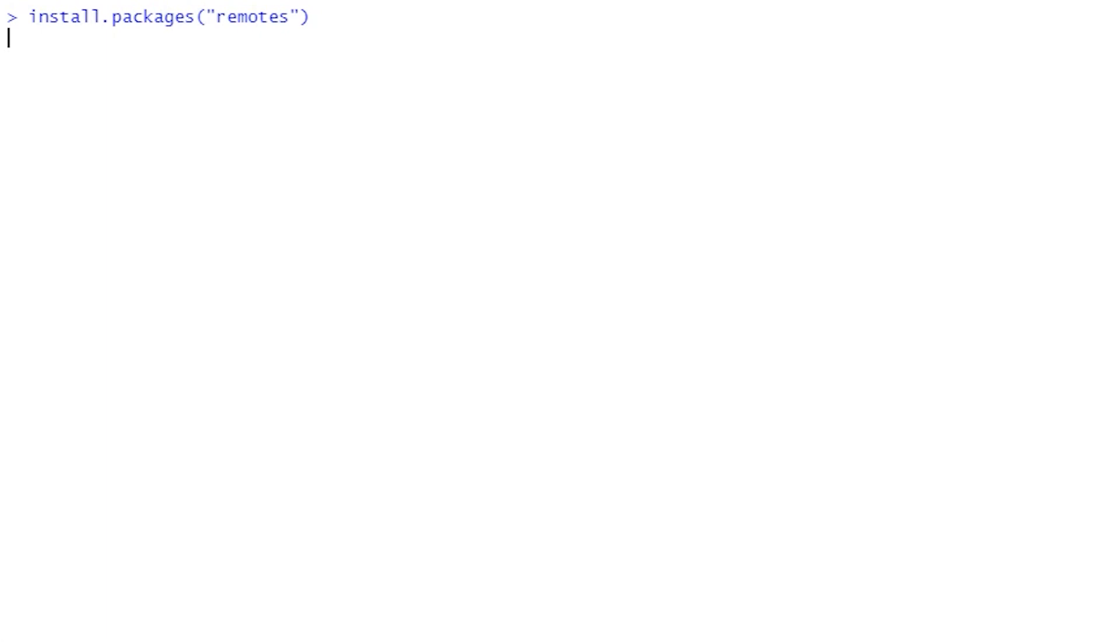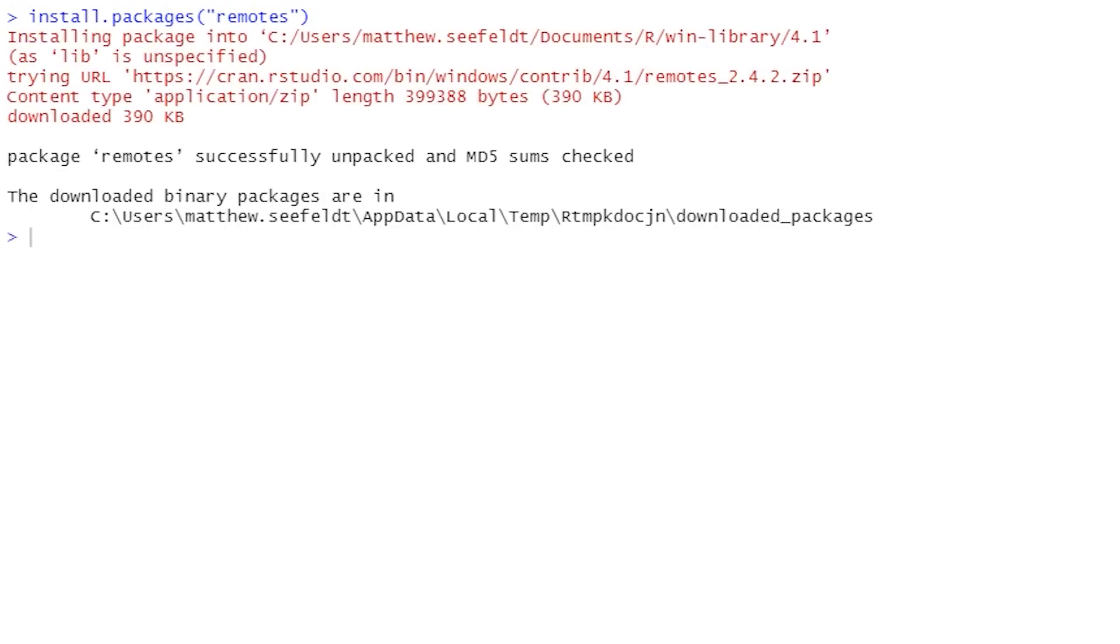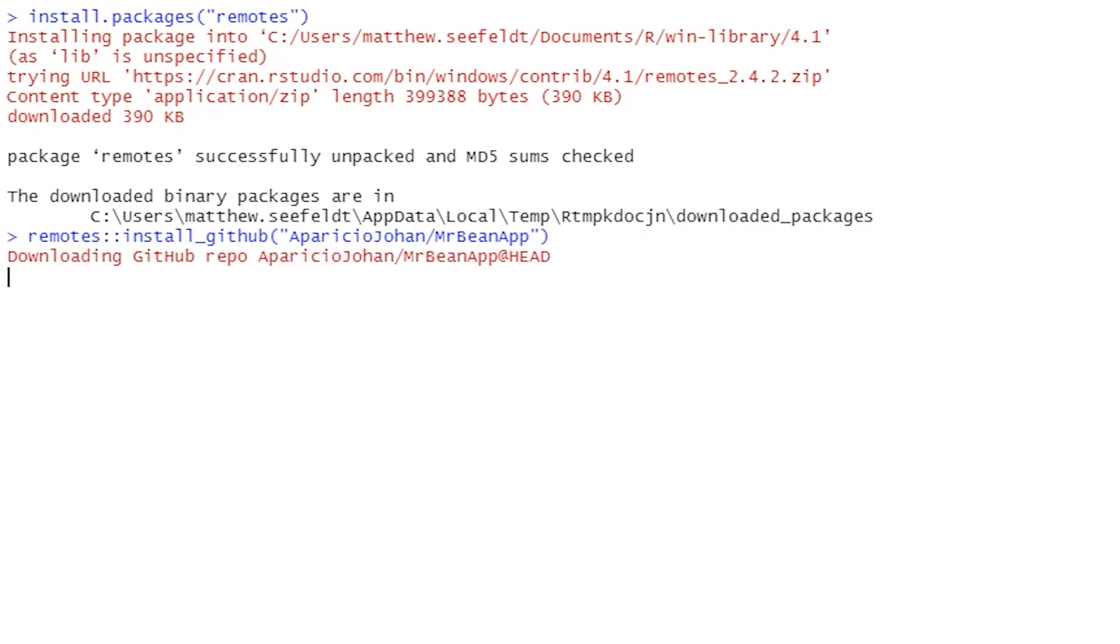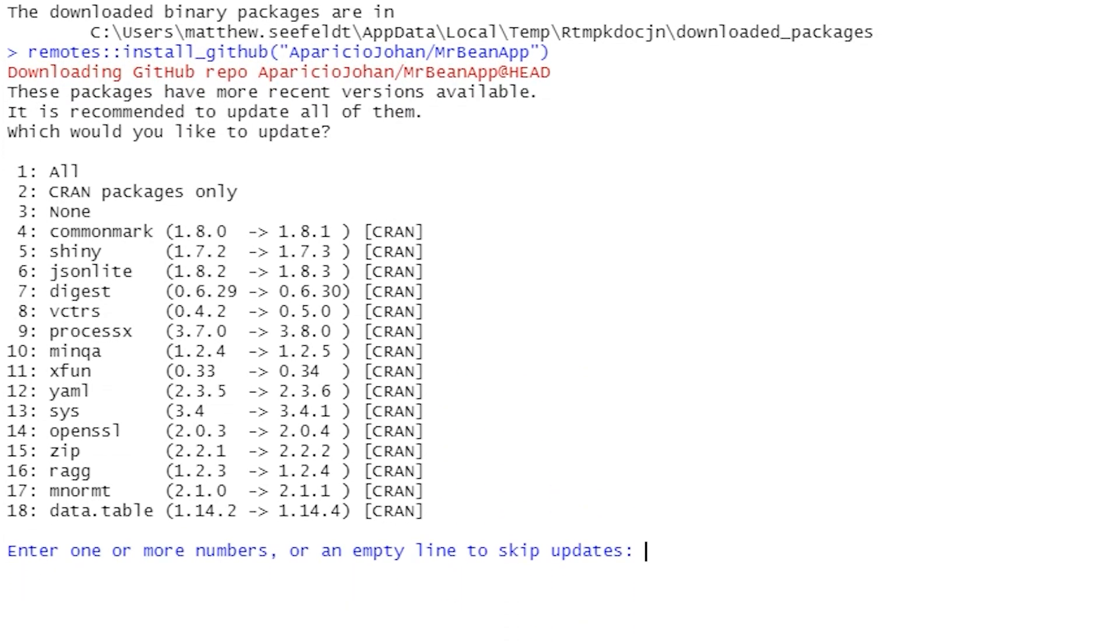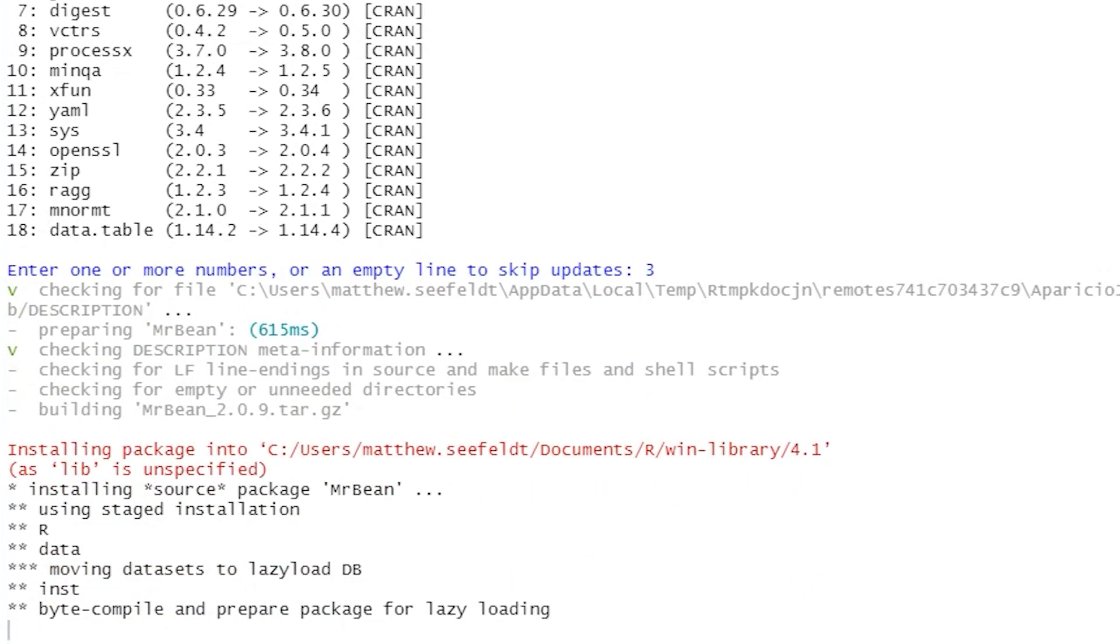Then, we can use remotes colon colon install GitHub AparicioJohan slash MrBeanapp to install MrBean directly from GitHub. You'll be prompted to update dependency packages, which you can do if you wish by typing 1. It's not required, so I'll skip this by typing 3.